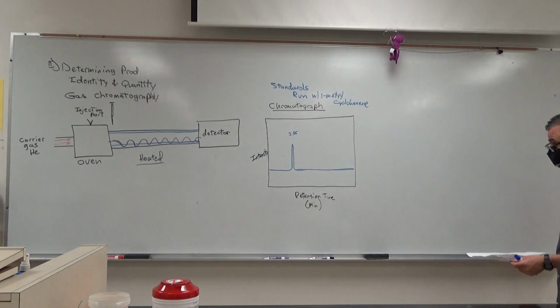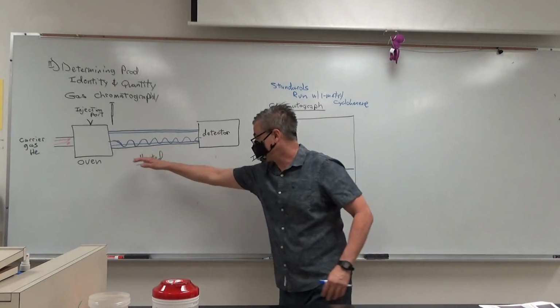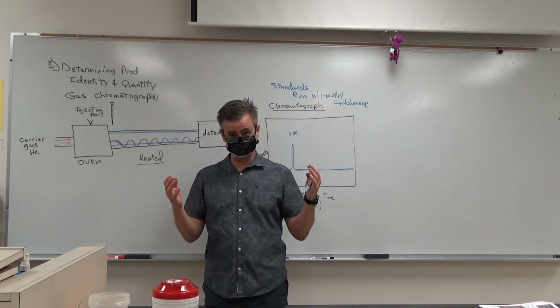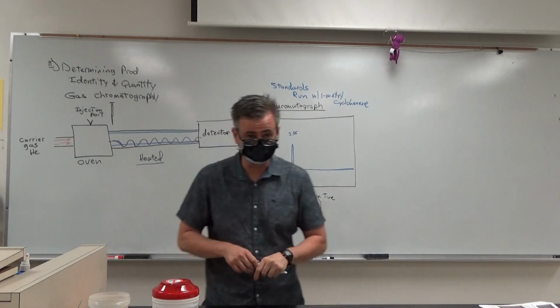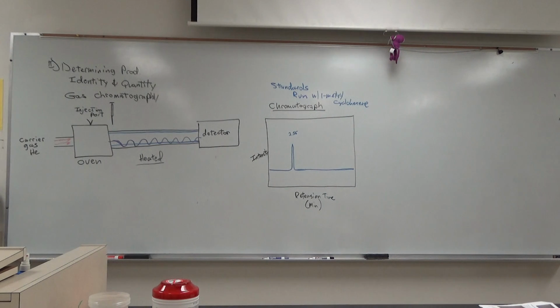Okay? And surprisingly, retention times, as long as, remember I said you ramp the temperature? Okay, you ramp the temperature. As long as you're pretty consistent about how you ramp the temperature, the retention times are pretty consistent. Okay? Interestingly, they're not consistent enough year to year. So we can't use last year's retention times. Who knows why?